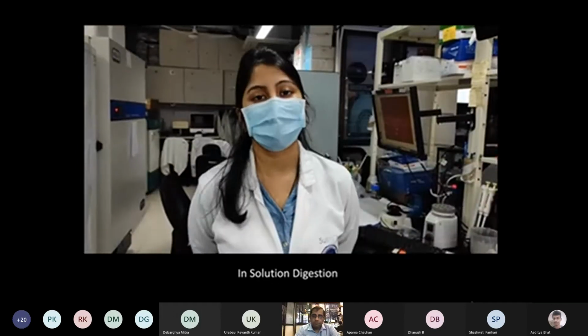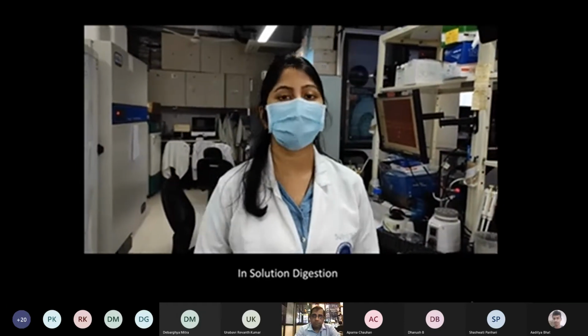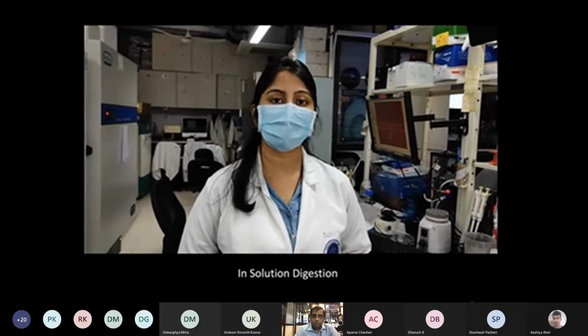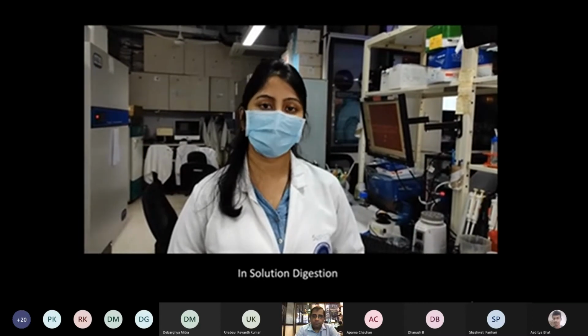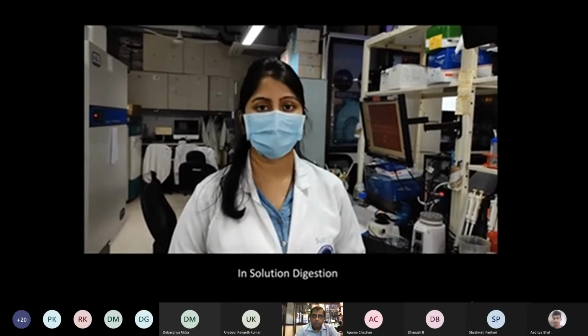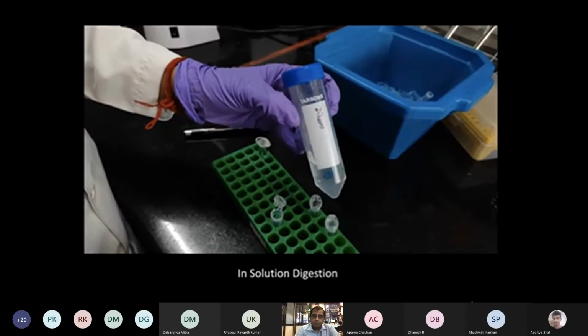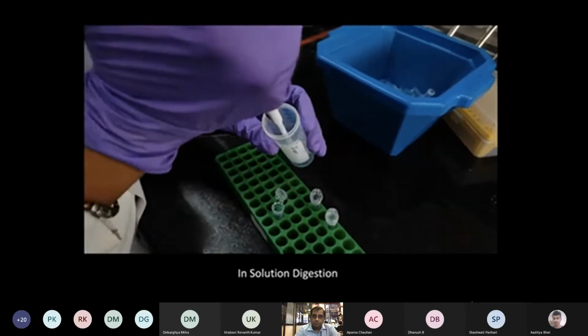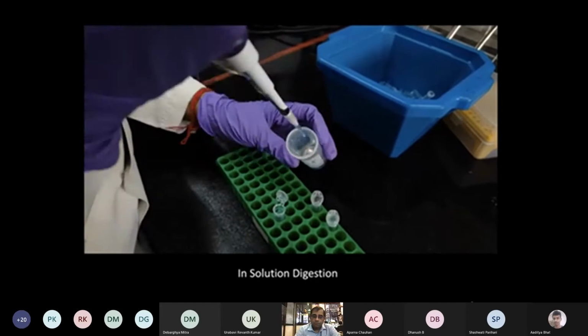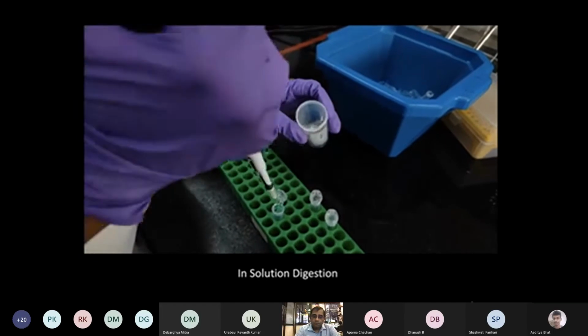So after completing the steps of reduction and alkylation, the next step is addition of trypsin for the digestion. Before that, the step is dilution, which means we first need to dilute the molarity of urea that was present in the initial sample. So the diluent is used for diluting the sample. An appropriate volume of diluent is added to the sample in order to dilute it.